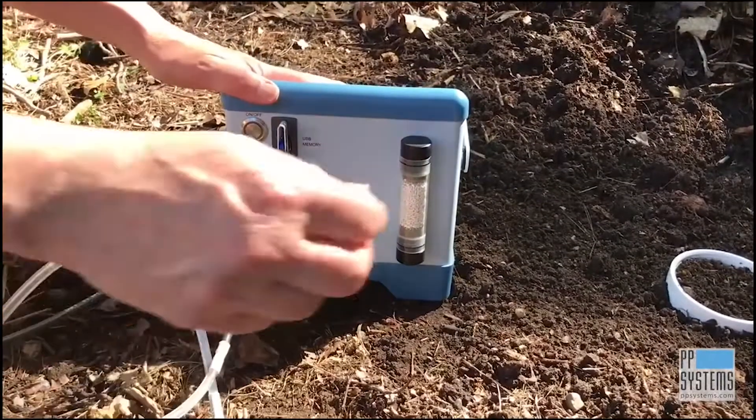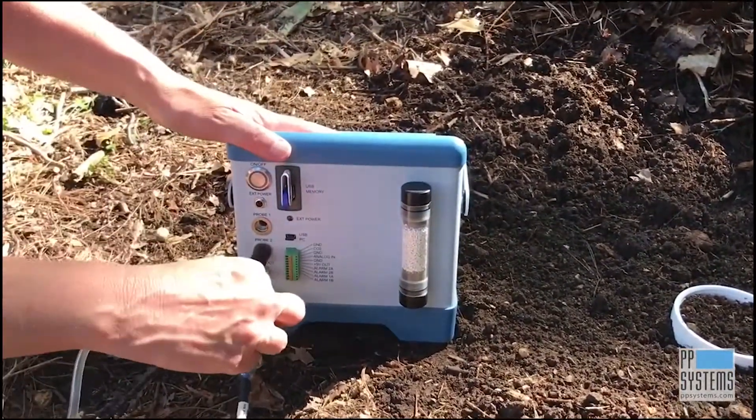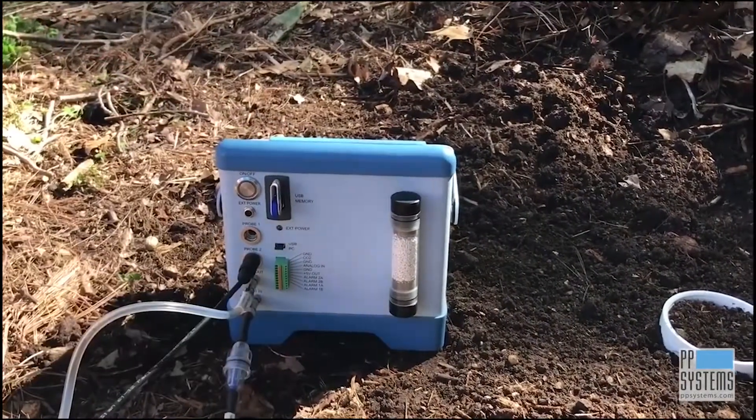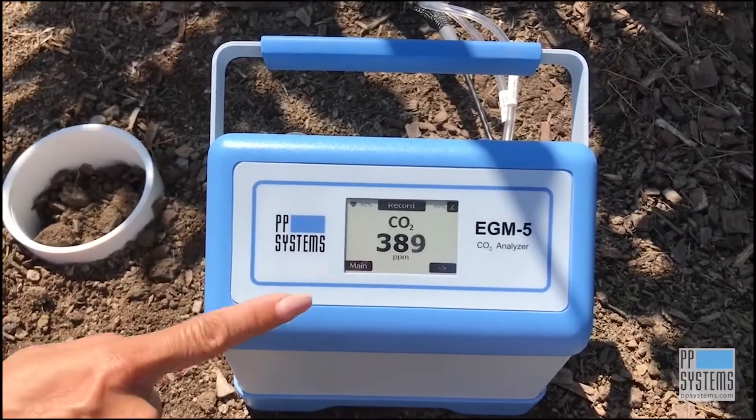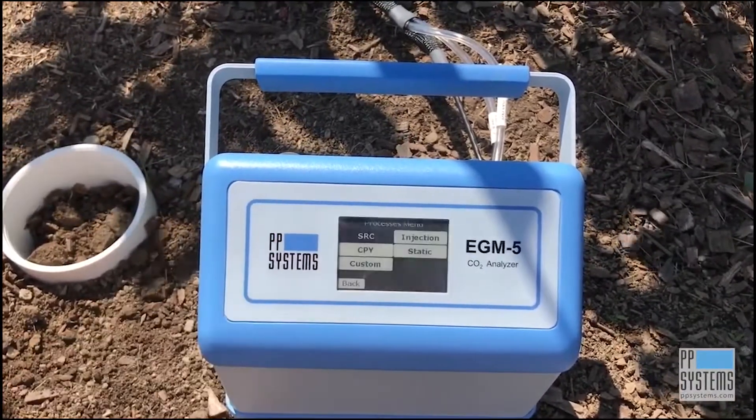With your data storage device in place, secure the SRC-2's electric and pneumatic connections as shown here and power up the EGM-5. Using the touch display, select Main, Processes, and then SRC. Next, press the right arrow to begin.